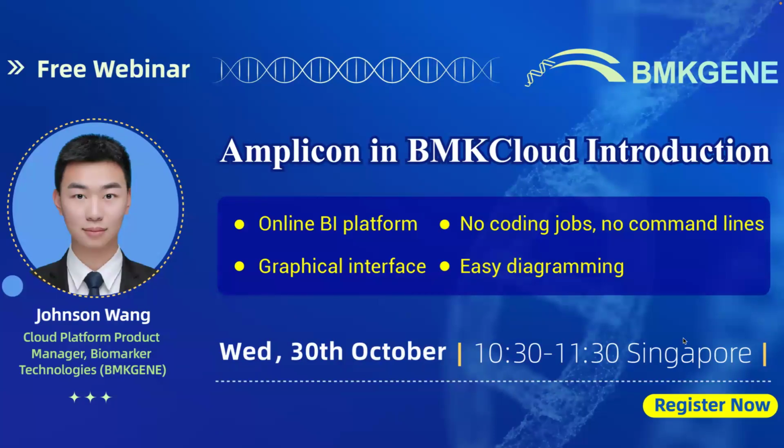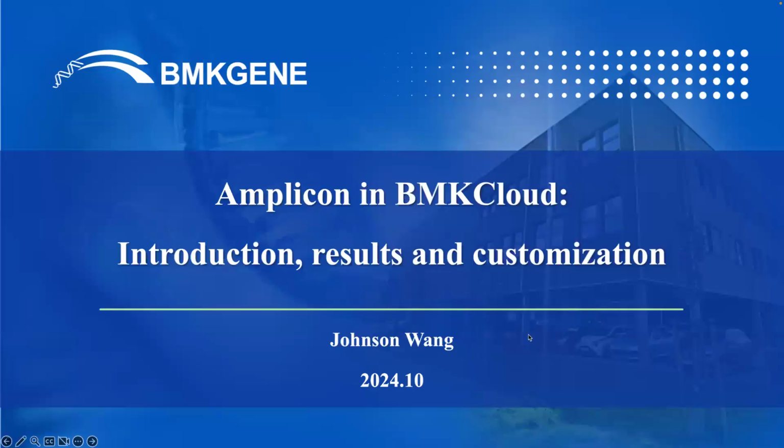Thank you, Lydia. Hi, everyone. It's Johnson. Today, we will talk about Amplicon application in BMKCloud. It will contain introduction, results, and customization. I will first introduce to you about BMKCloud and demonstrate how to use BMKCloud step by step.